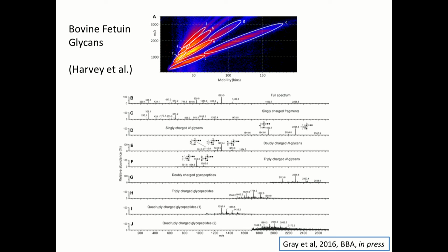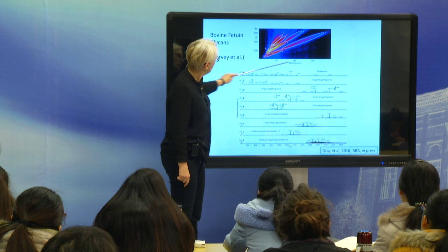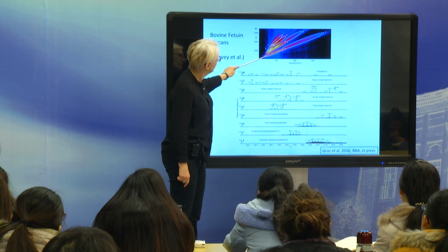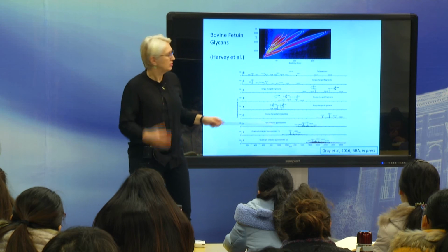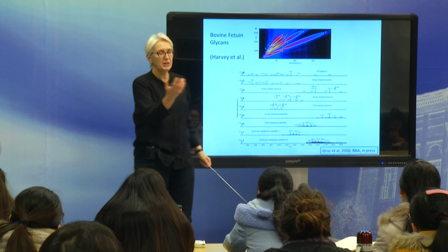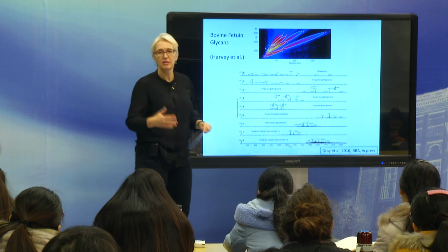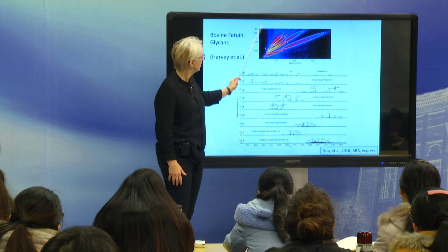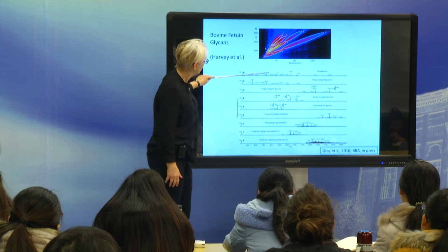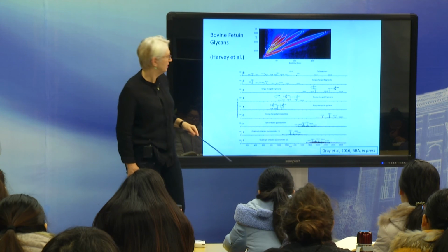But basically ion mobility, where you can actually separate ions by mobility, but also M over Z. What you get is these what they call bins. So this sort of heat map is meant to show where the ions are. So these are the peaks. The colors are the peaks, and they're plotted against the mobility. This is ion mobility and M over Z. And because you've got 2 parameters, you get increased separation. You can then get mass spectra of all these different peaks. It's a sort of 2-dimensional technique.